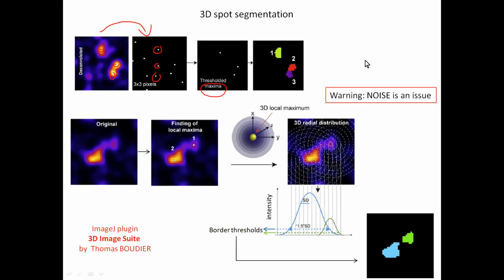You can detect the dendrite, detect the spots, and then decide to keep only the spots which are along the dendrite. This you can really do. We can contact each other later if you want to go further into that, but this is feasible.